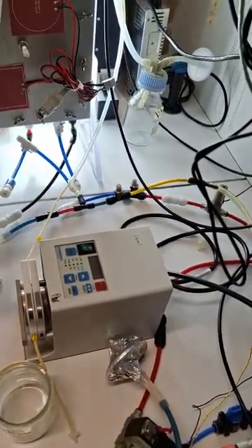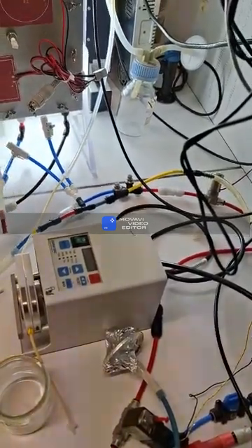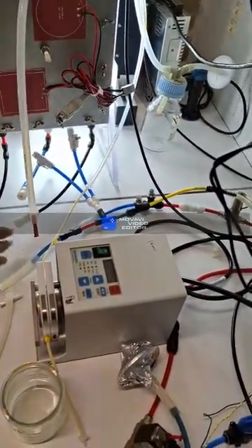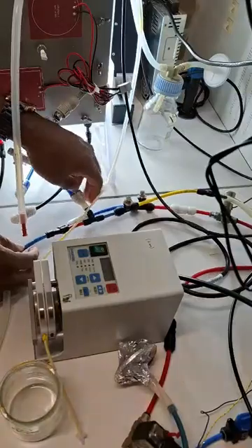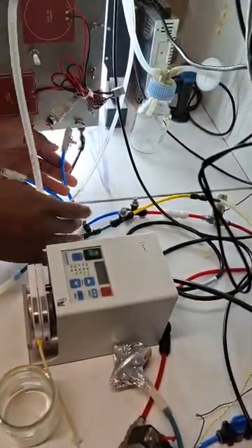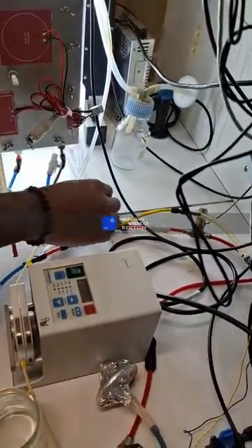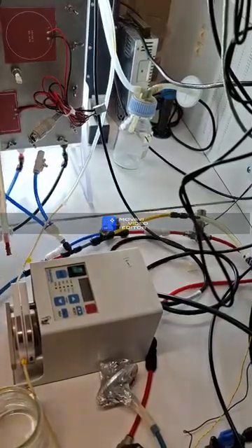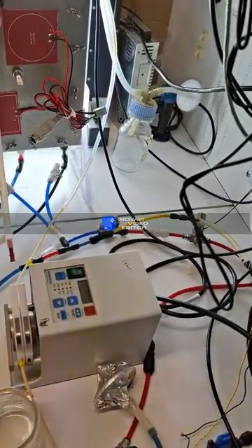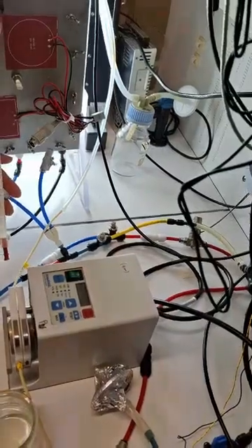And you will have to put both at the same time, for example, into the middle one. And here I made just one deviation, a deviation for both, just with air here. So here you will have air, and here you have some valves, because it will be complicated to equilibrate the flow. This is why it's recommended to have this.